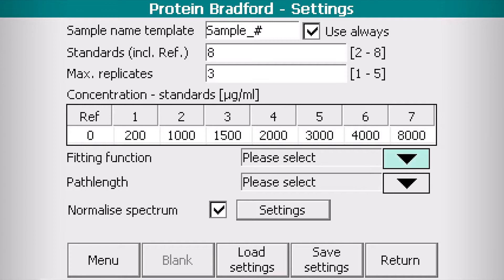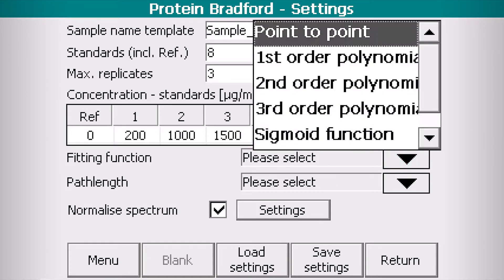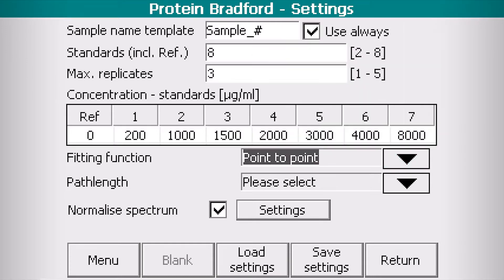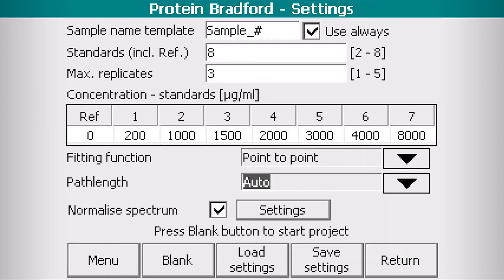Select your fitting function and path length. Normal for low concentrations, short for high concentrations, auto for automatic selection.